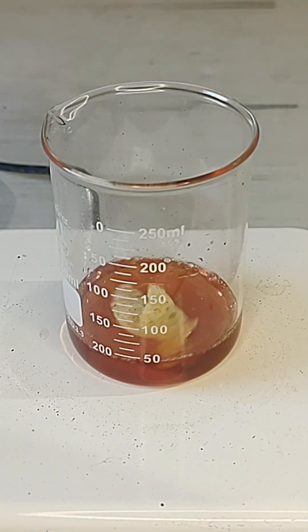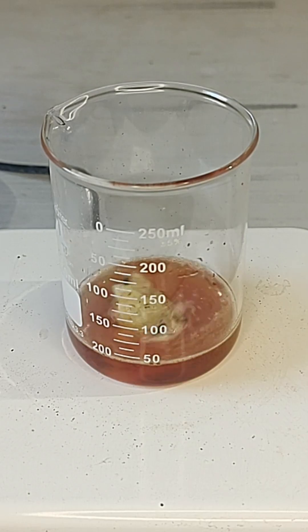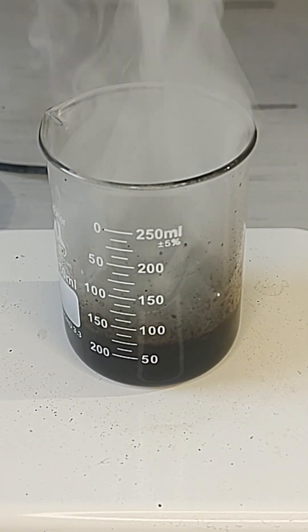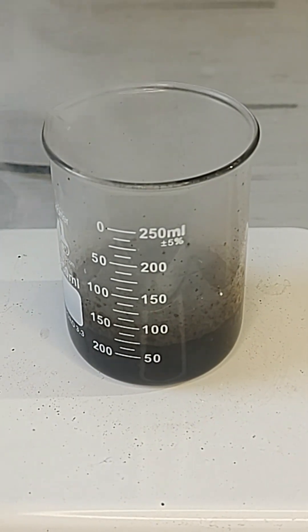Once it had all cleared, I noticed that I also had a potato chip lying around, so I decided why not? I'm an adult and I'll destroy as many potato chips as I want to. And again, it dissolved like it had never even been there.